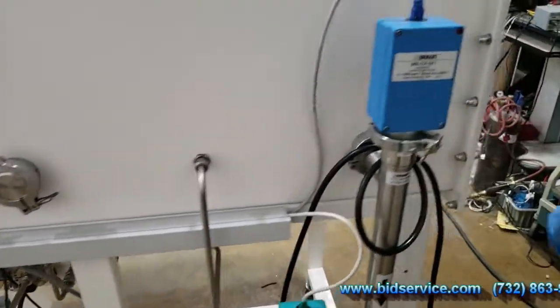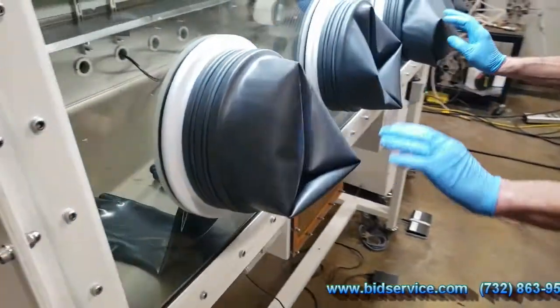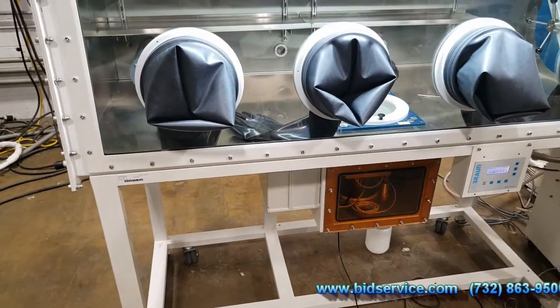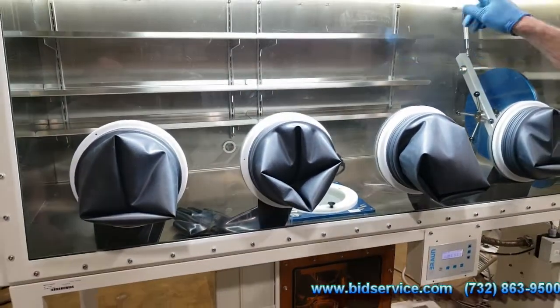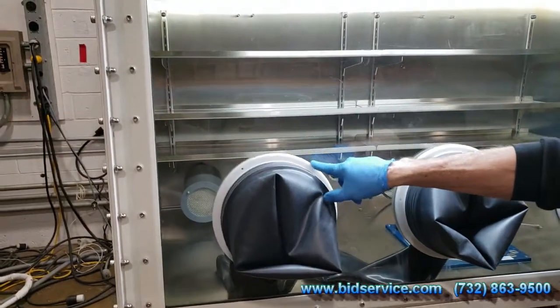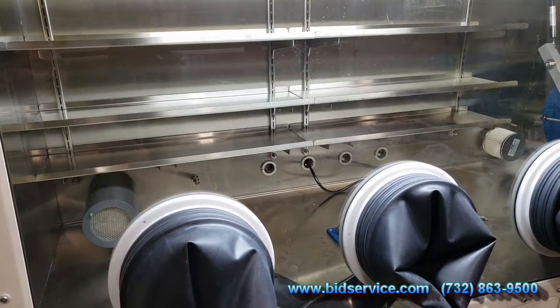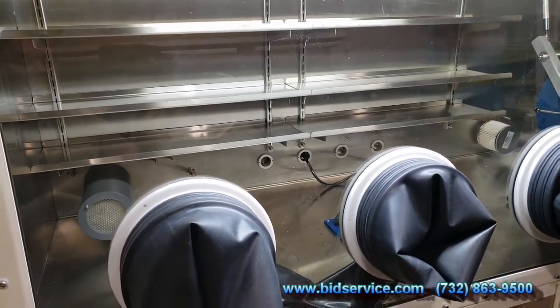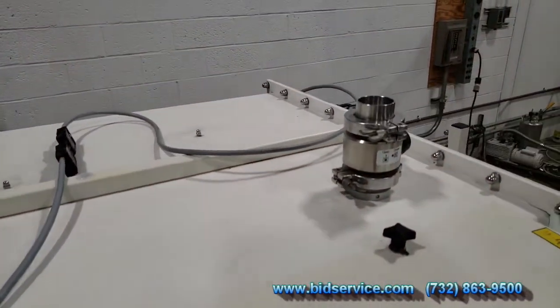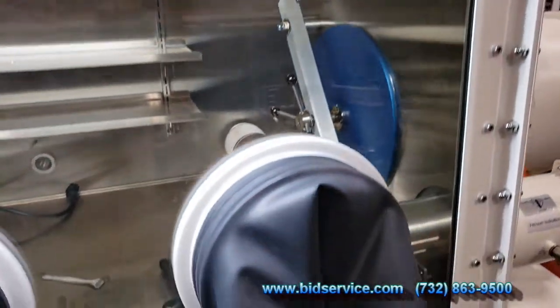Around the front — the gloves have been replaced, so you have two sets of gloves. The filter in the back is coming in, and on the out there's a solvent trap which has carbon media in there. There is a quick purge valve up here. I don't want to activate it right now — I'll show you this in operation by the pressure.